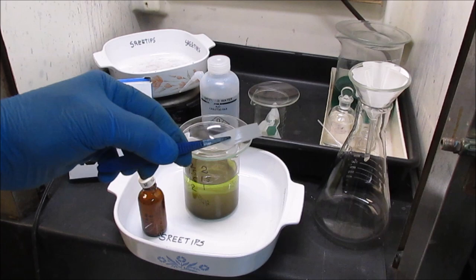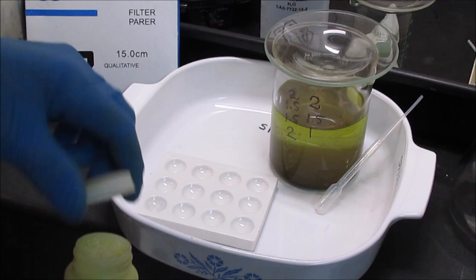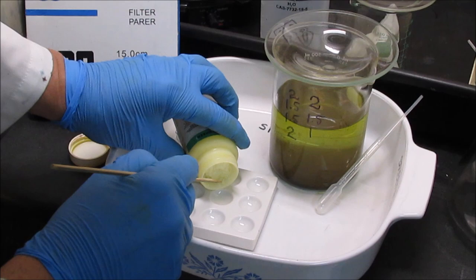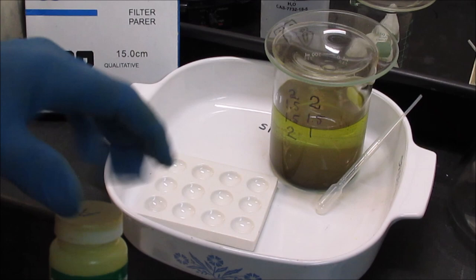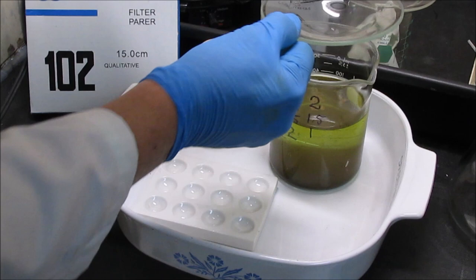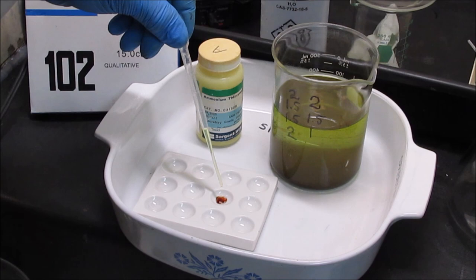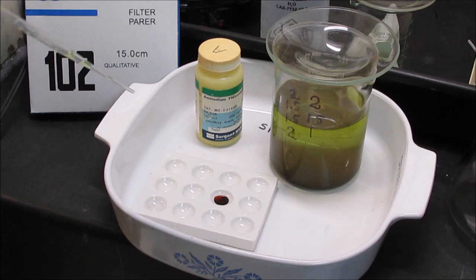Well, that stannous test was negative. And I'm a little curious now as to what we might have in solution. I've got some ammonium thiocyanate here. I'm gonna put a few granules of that in a spot plate, and then I'll get some of this solution out of the beaker and put it in there. If it's iron, which looks just like gold in solution, this solution will turn bright blood red when I put it on that ammonium thiocyanate. There it is. Blood red. That confirms we got iron in solution.